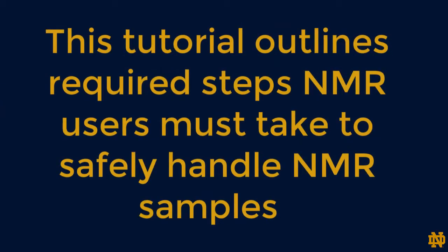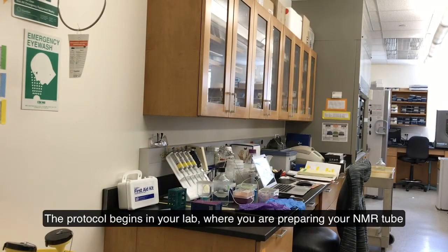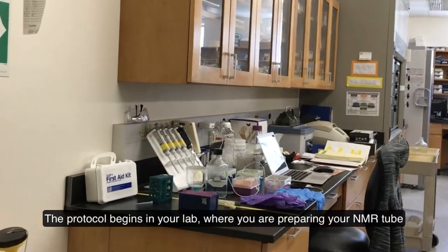This tutorial outlines required steps NMR users must take to safely handle NMR samples in our facility. The protocol begins in your laboratory, where you are preparing your NMR tube.